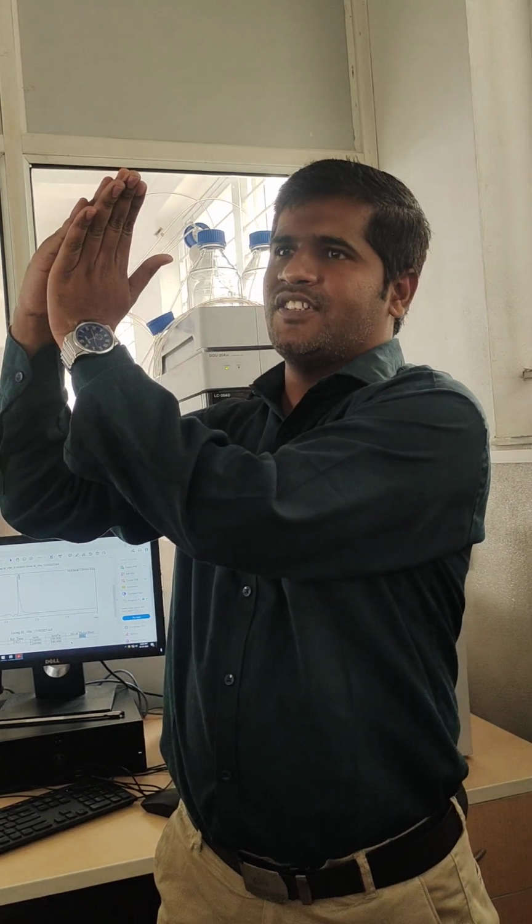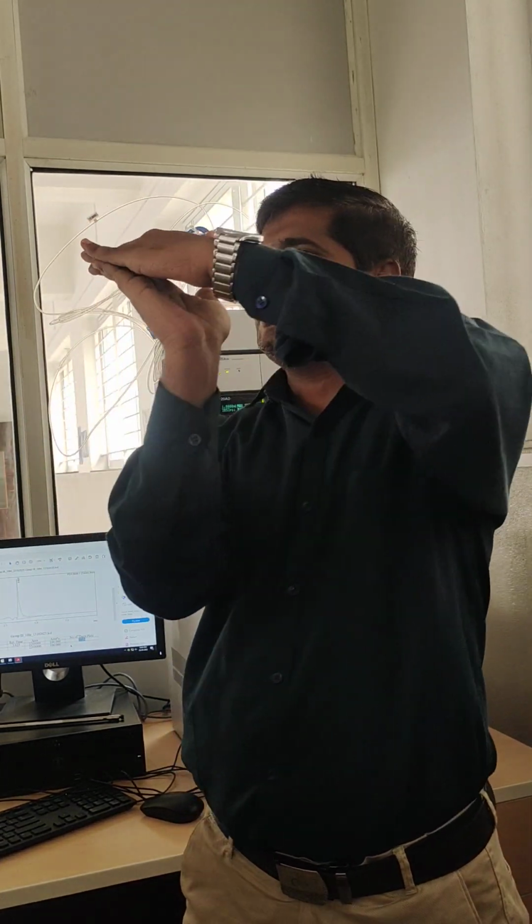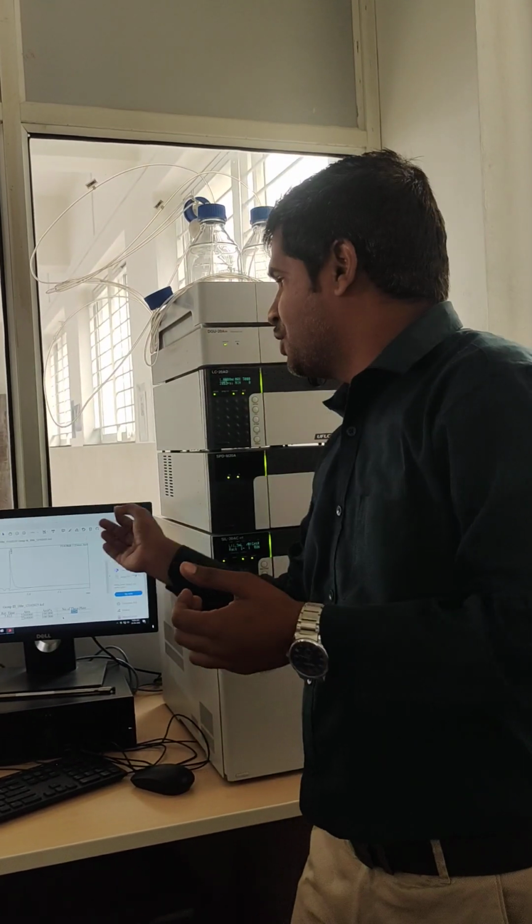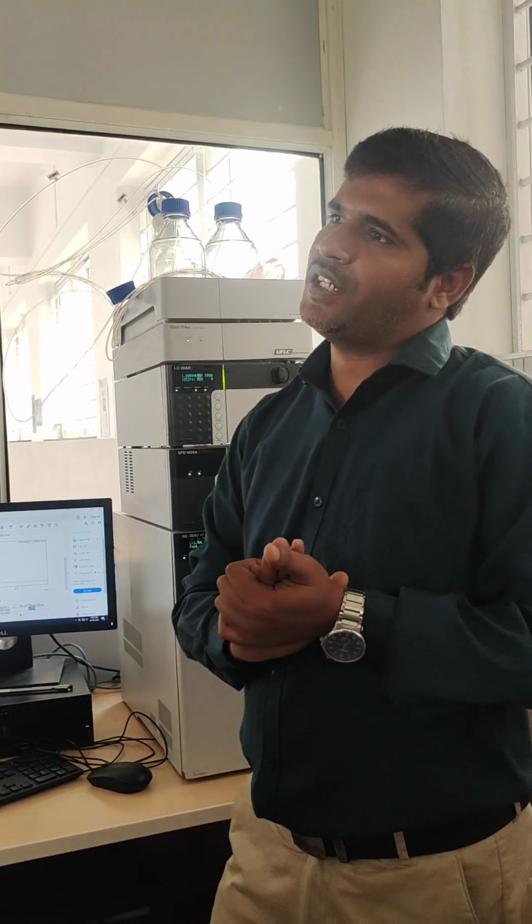If peak fronting is there, the peak is coming in that direction. If peak tailing is there, the peak is coming in that direction. So that will not say that this method is good. We cannot analyze the sample with the compound having asymmetry factor less than 1. So this is the system suitability parameter.